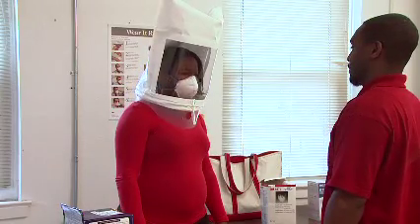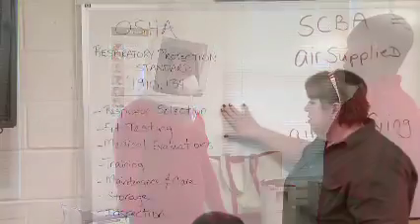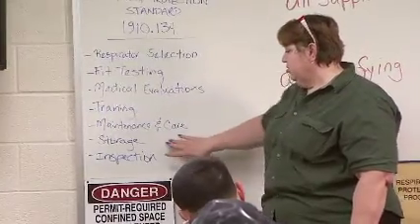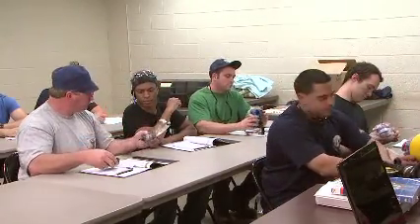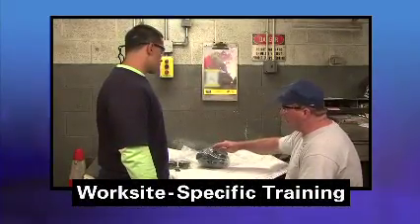This video has provided you with a brief overview of OSHA's fit testing requirements. There are many other things that you must know and do before you can safely use a respirator in a hazardous work environment. While this video may be a part of your respiratory protection training, your employer must also provide you with additional training on respirators, including worksite-specific training.